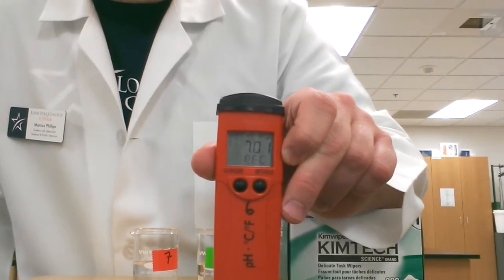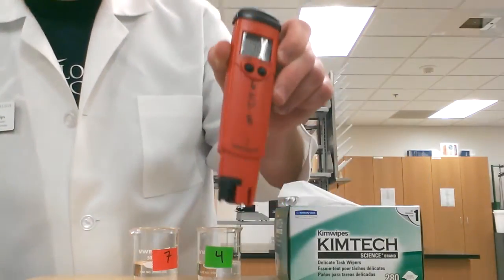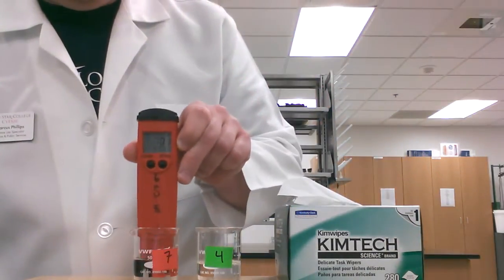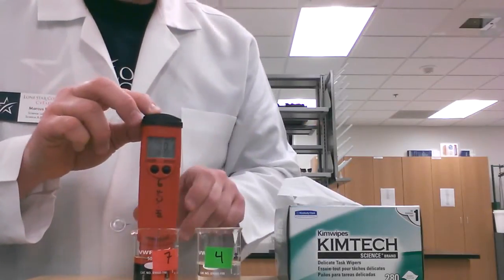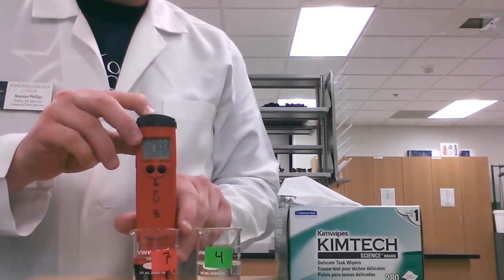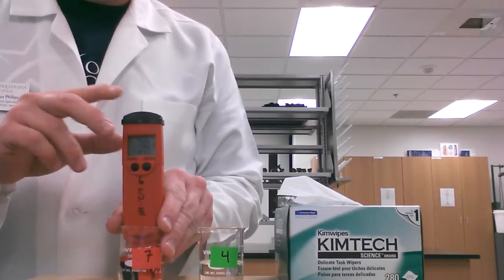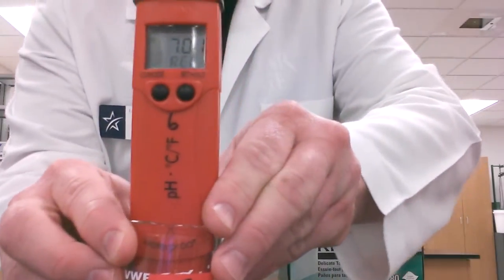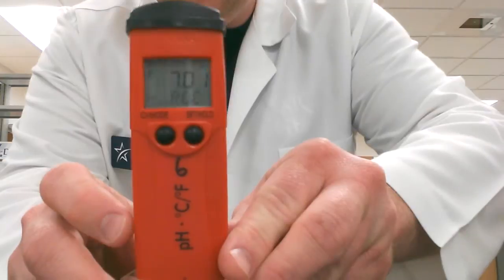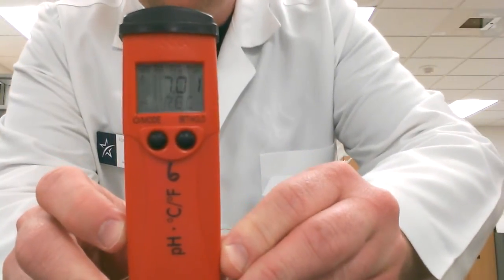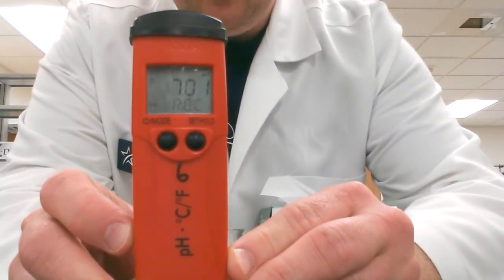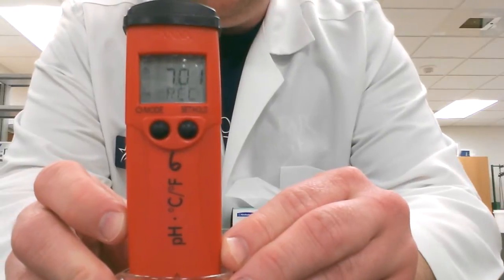When you see that, that's going to tell you to put it into the pH 7 solution, so we're going to do that here. So this is calibrating to the pH 7 solution. This may take 30 to 45 seconds.